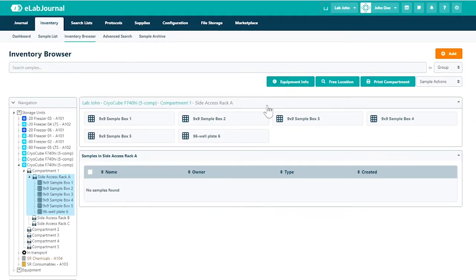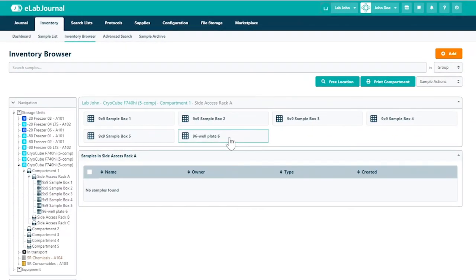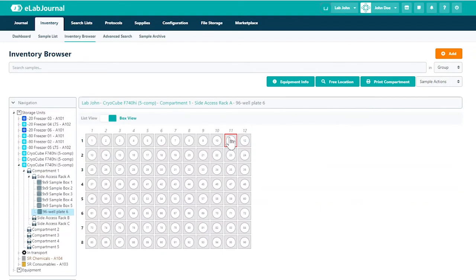This allows you to fully customize a freezer to match the exact configuration of the physical device in your lab.